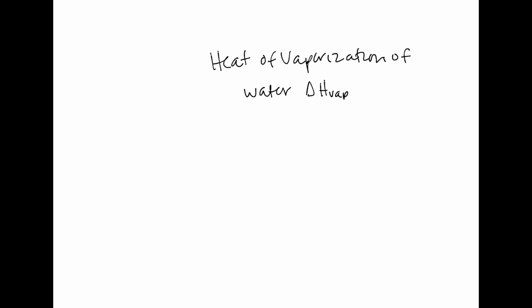This is our pre-lab video for our heat of vaporization of water lab. And sometimes we abbreviate that like this. In this lab, we're also going to find the heat of fusion, which is the delta H of fusion.